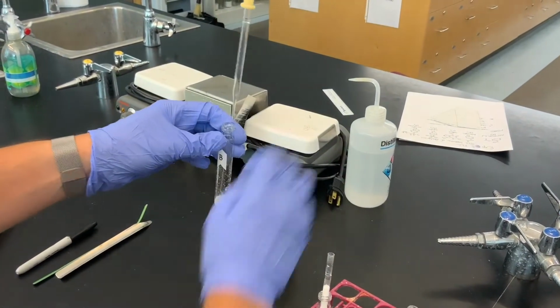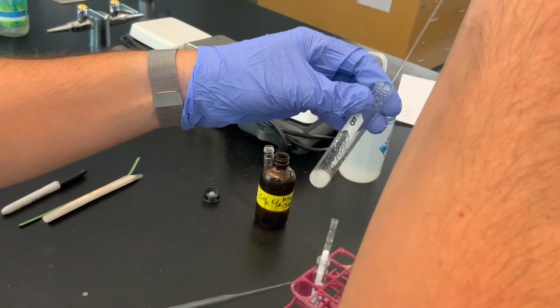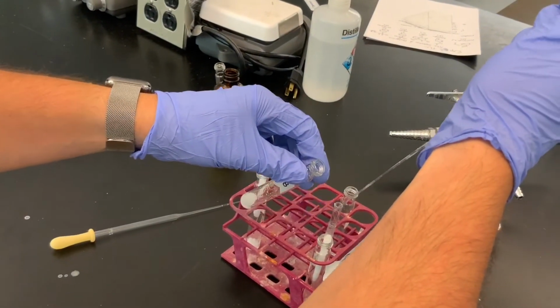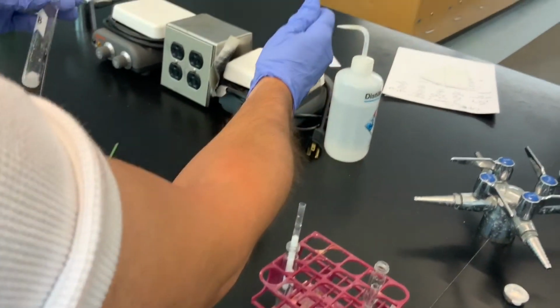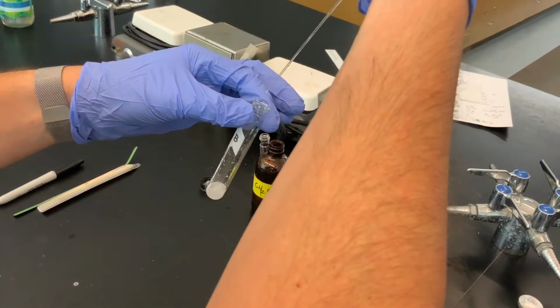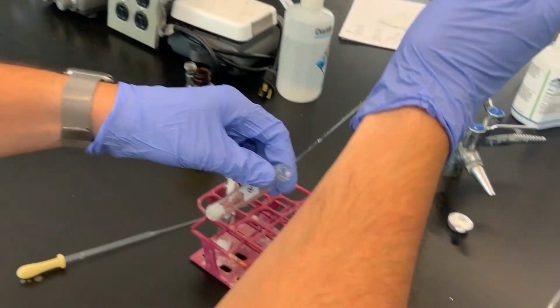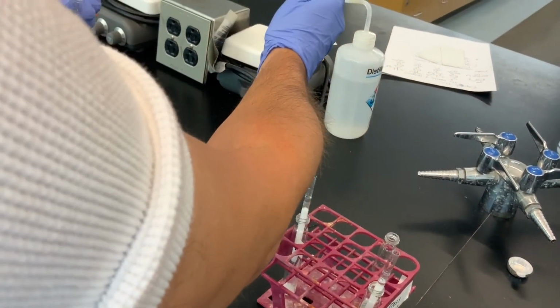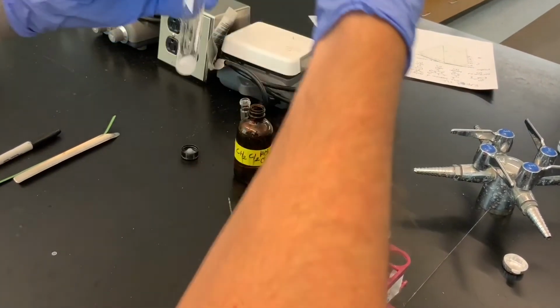So rinse number 1. Once again, get the walls of the glass to try and get any sort of residue of benzoic acid off of it, but once again, we're expecting there to be very little benzoic acid. Rinse number 2. And then finally, the last aliquot of methylene chloride, rinse number 3.